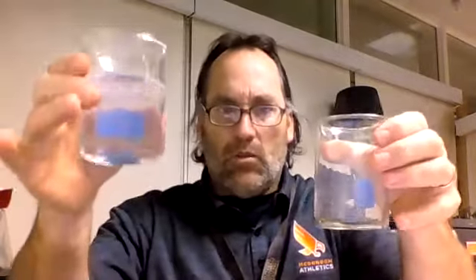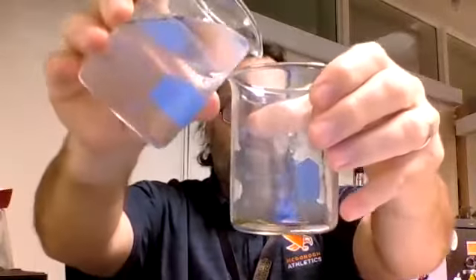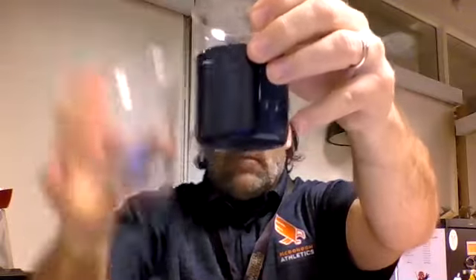So what I'm going to do is take my starch water solution and pour it from this one into the one with the iodine. All right, here we go. And it gives me a very, very nice purple color.